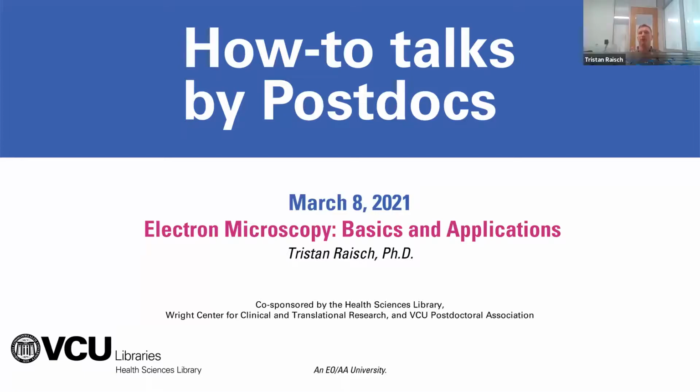This won't replace a formal training session if you're looking to get started on EM, but we'll give you the background and baseline understanding to be able to either A, tell whether this tool is appropriate for your research, or B, to understand and make sense of why researchers in your field use it and how to better interpret their data. All right, here we go.